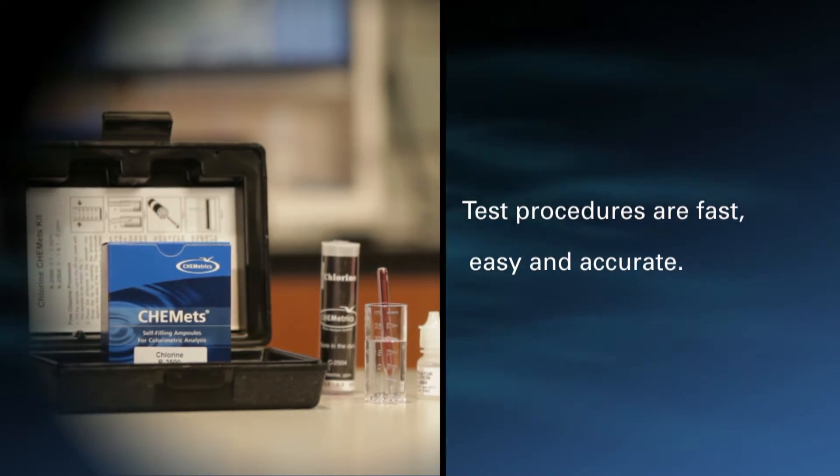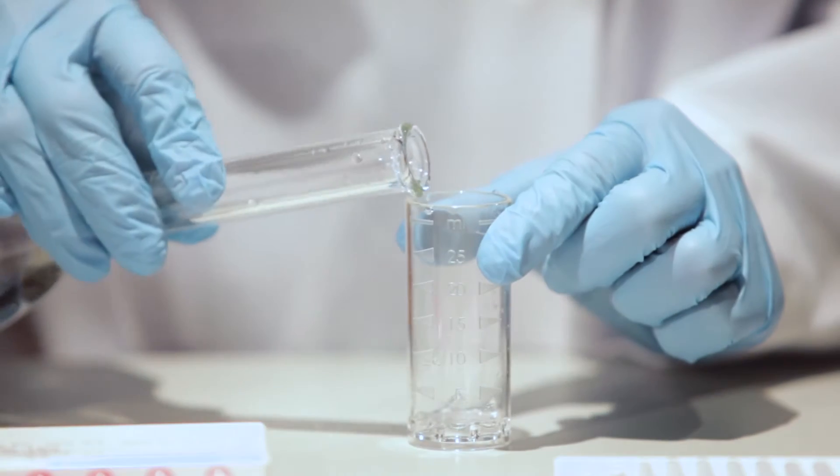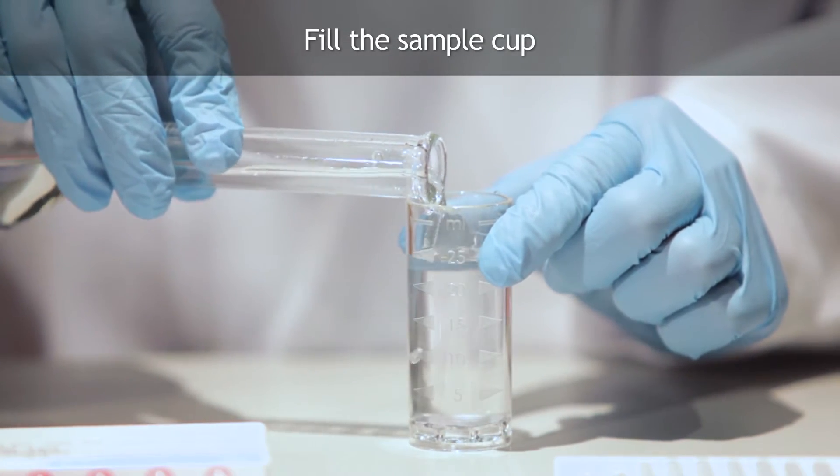Test procedures are fast, easy and accurate. To perform a test using the CHEMets test procedure, fill the sample cup to the 25 milliliter mark with the sample to be tested.